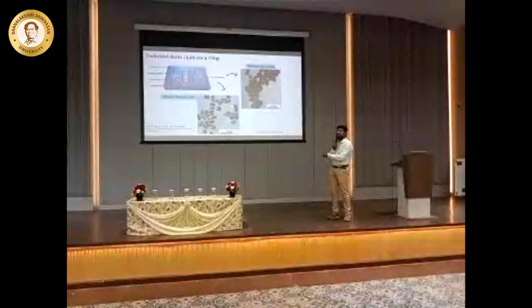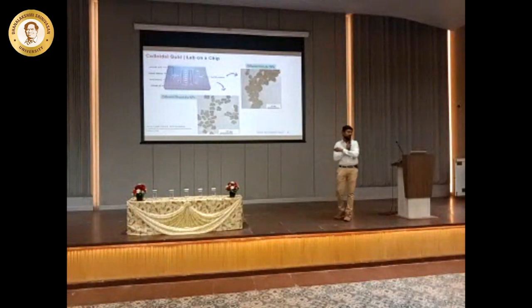Here we can see bony structures. Can you see here a bony kind of structure? Right here it's going to be spherical structures. So I have tuned my inlet parameters wherein I can create my structures well.